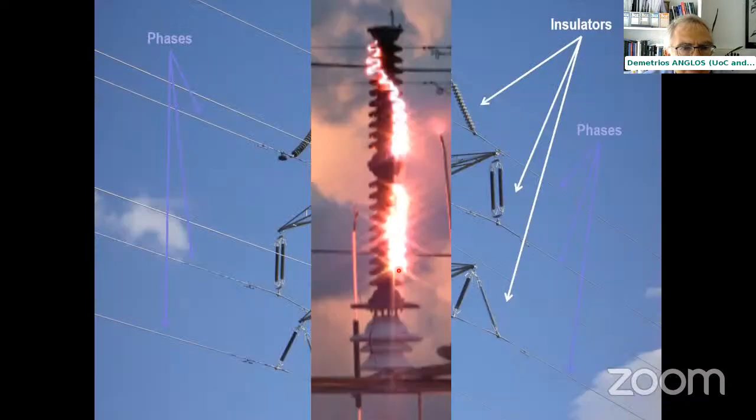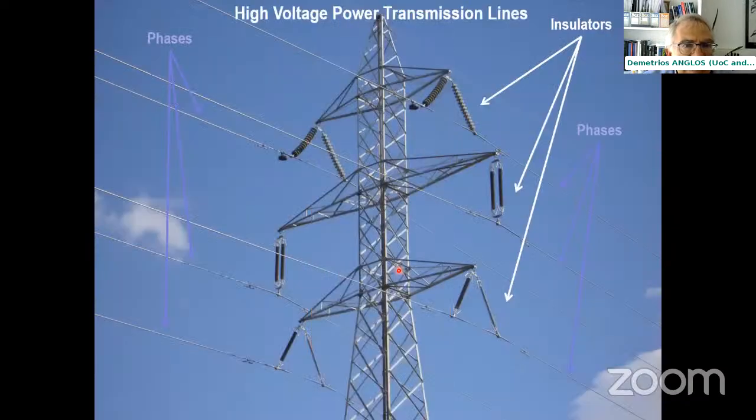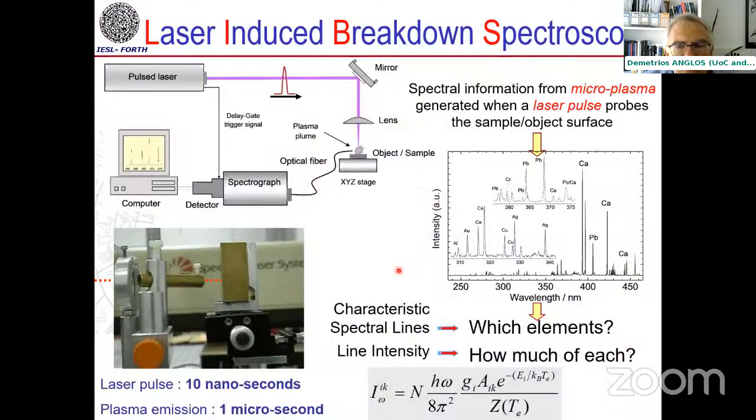So let me just go back one slide, because I want to say a few words about this LIBS technique, which I mentioned a minute ago. This is, again, laser-induced breakdown or plasma spectroscopy. We use a pulsed laser, typically nanosecond pulse width. We focus it on the object, the sample, the target.